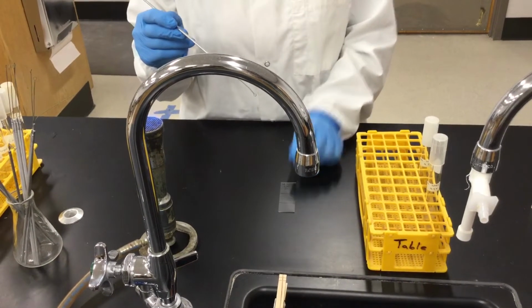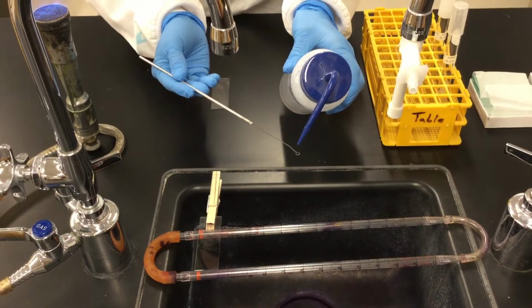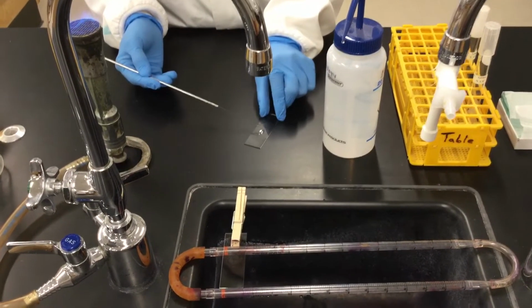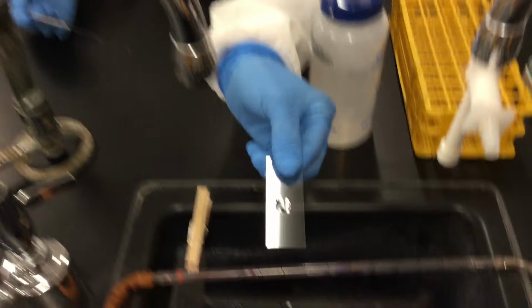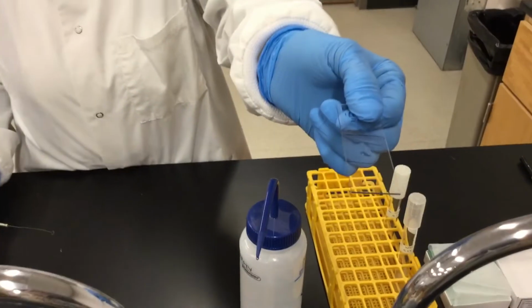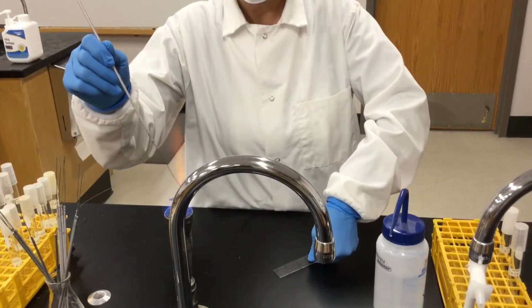When you're doing that for the solid media, once you sterilize your loop, you're going to add a drop of water into the mid portion of your sterile loop, and then put it in the area where you're going to make your smear. So let me show it to you. So that's the water. And now, since you added water with your loop, you need to sterilize your loop again, because you don't know if the water is sterile or not.